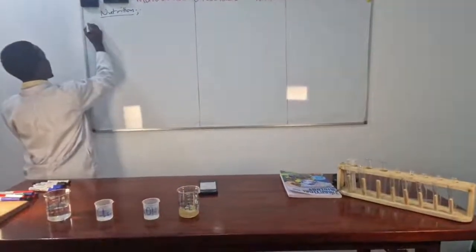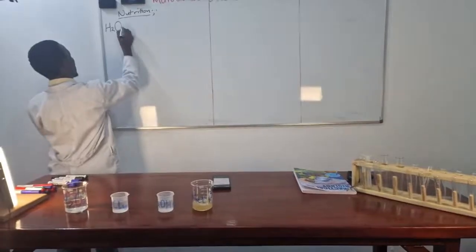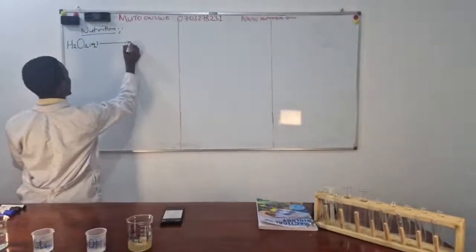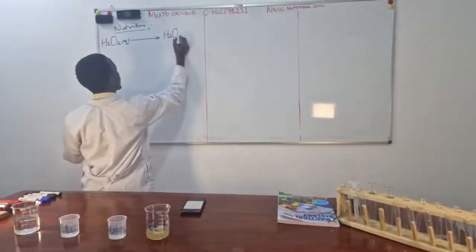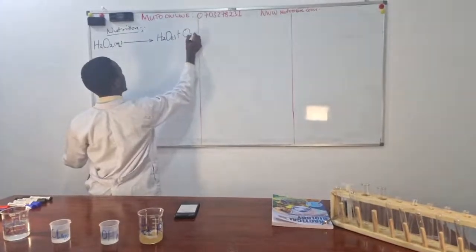So there is an equation there that the hydrogen peroxide they use as a bleaching agent is hydrolyzed to water and oxygen gas.